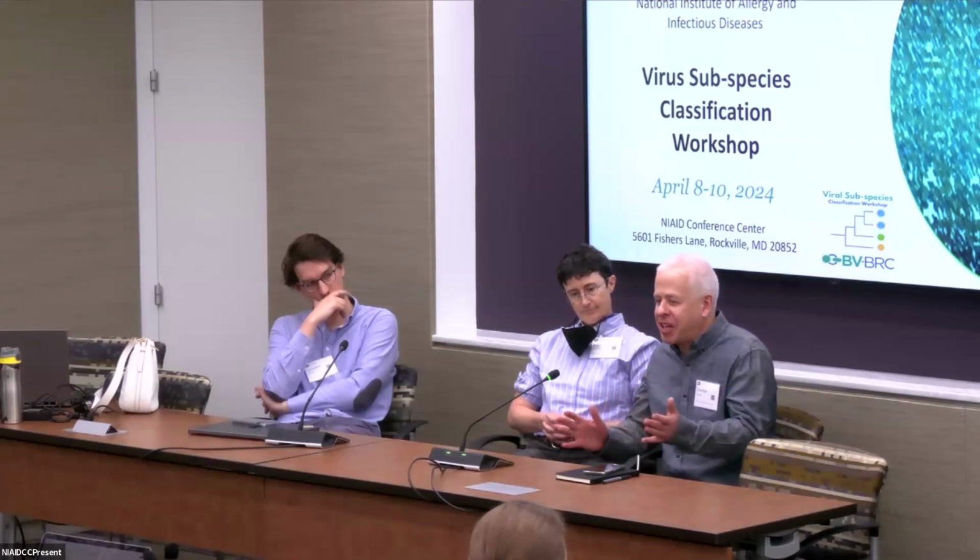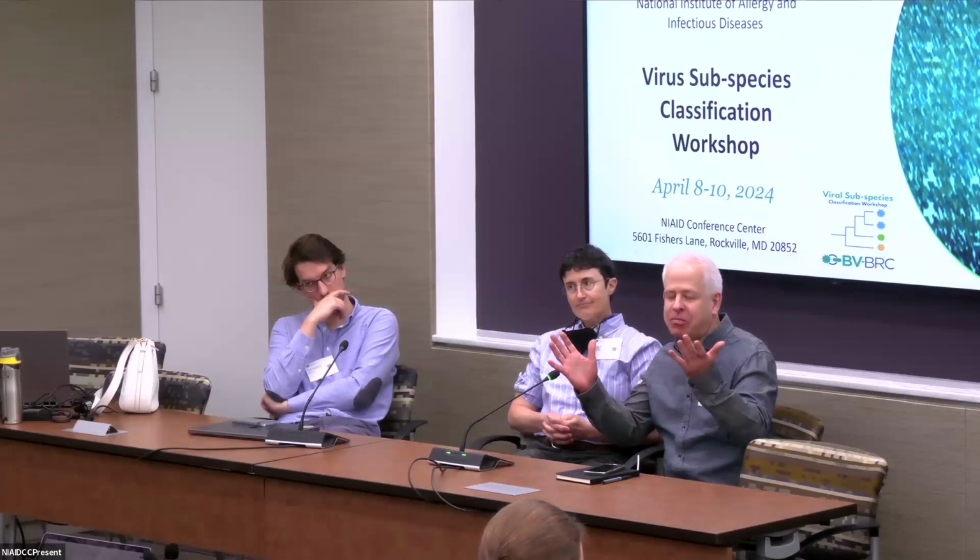And from a researcher's point of view, it's easier to look at and to understand a tree with 100 sequences as opposed to 10,000, something like that.